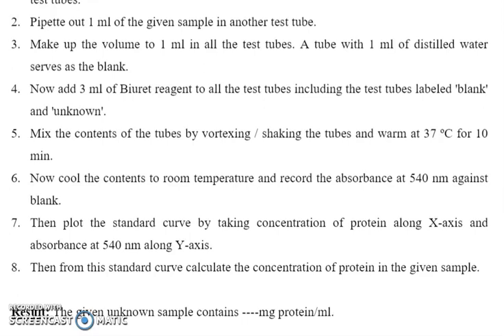You can take another protein also, but this chemical is easily available in all chemistry and biology labs.